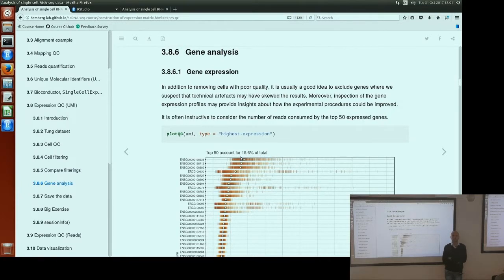If you can detect that by transcript counts anyway. I think the question is, what's the point of using spike-ins if you can use some other filtering procedures? So I think the whole purpose of using spike-ins is the assumption that you would have the same amount of spike-ins in all the cells if the experiment was good, because those are bacterial sequences, right?